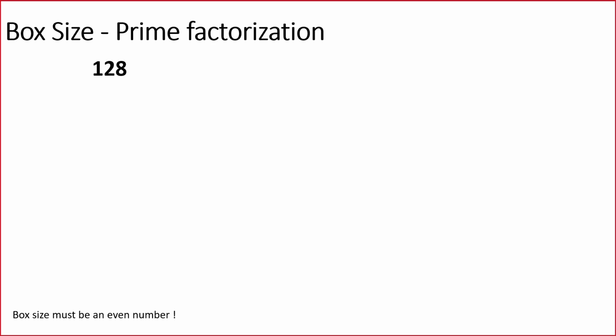Now, concerning box size. Box size must be an even number. I think all of the cryo-EM software insists that your box size has to be an even number no matter what, and it will run into an error if it is not. But there are tons of even numbers that we can choose from, and I will show you why some of these numbers are more and some of them less appropriate for the selection.